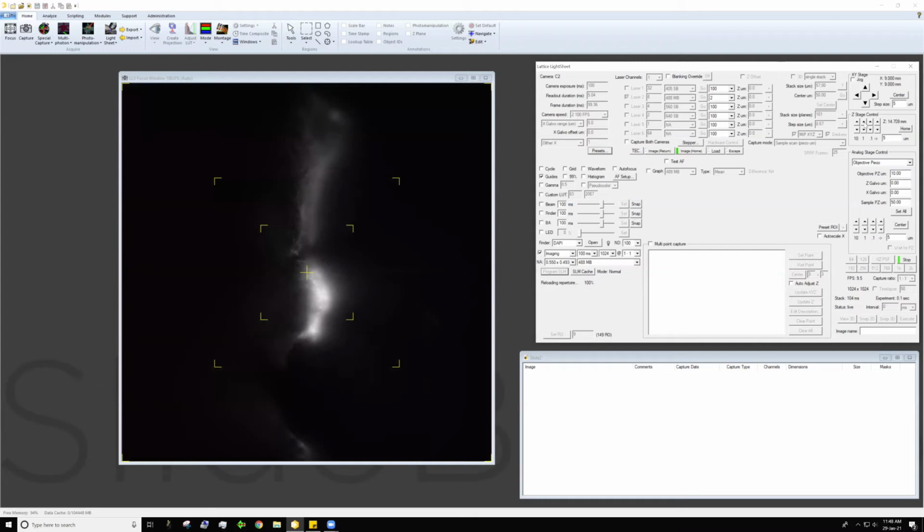This should look like a thin slice through your sample. This is caused by the geometry and it will never look like the full XY overview you might expect on a normal microscope. I will call this signal the sheet from now on, and it takes practice to get used to finding a particular feature in this limited field of view. You can then move in X and Y to find cells you want to image.